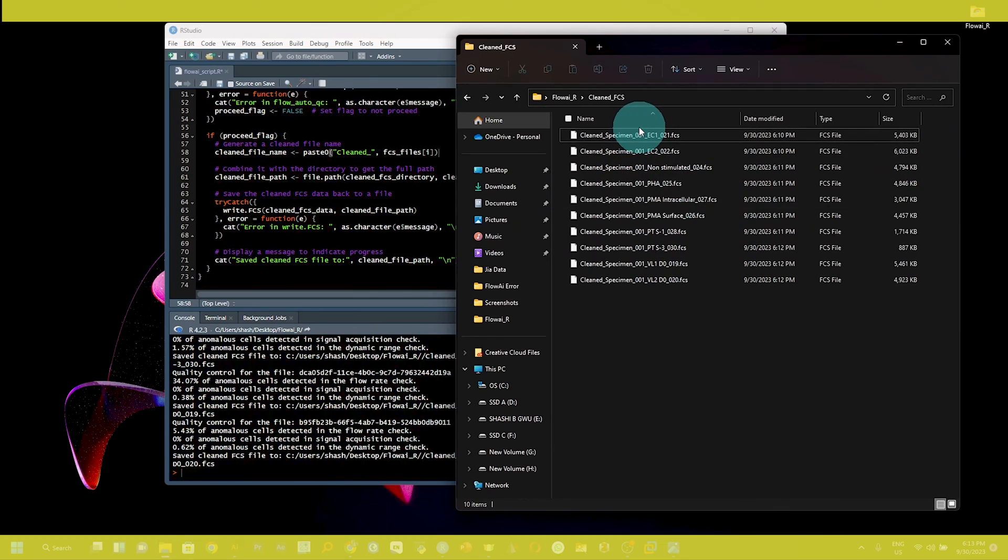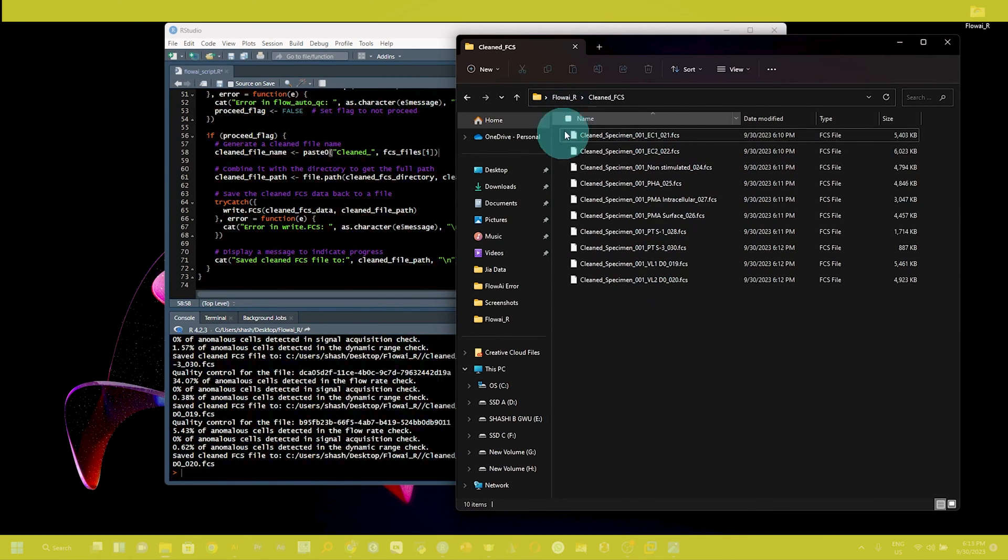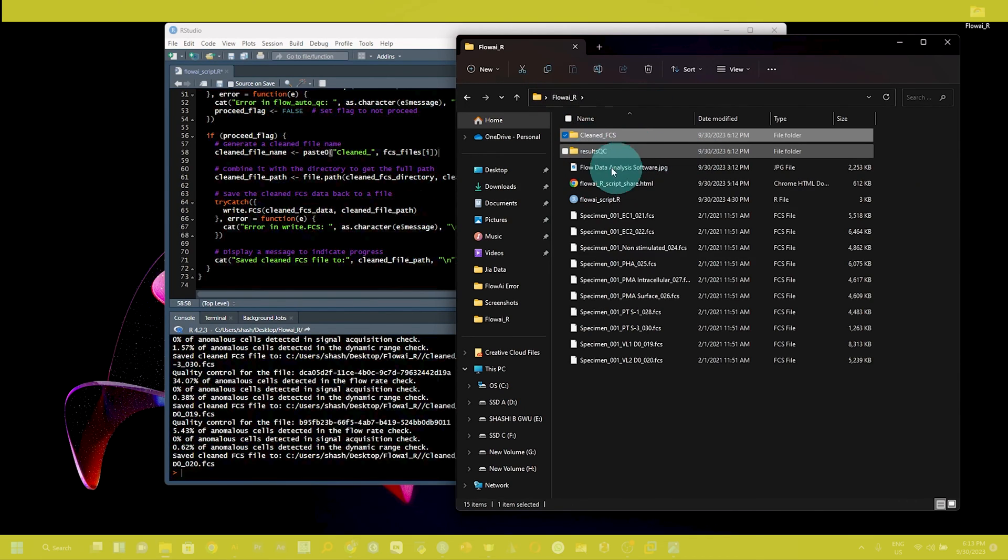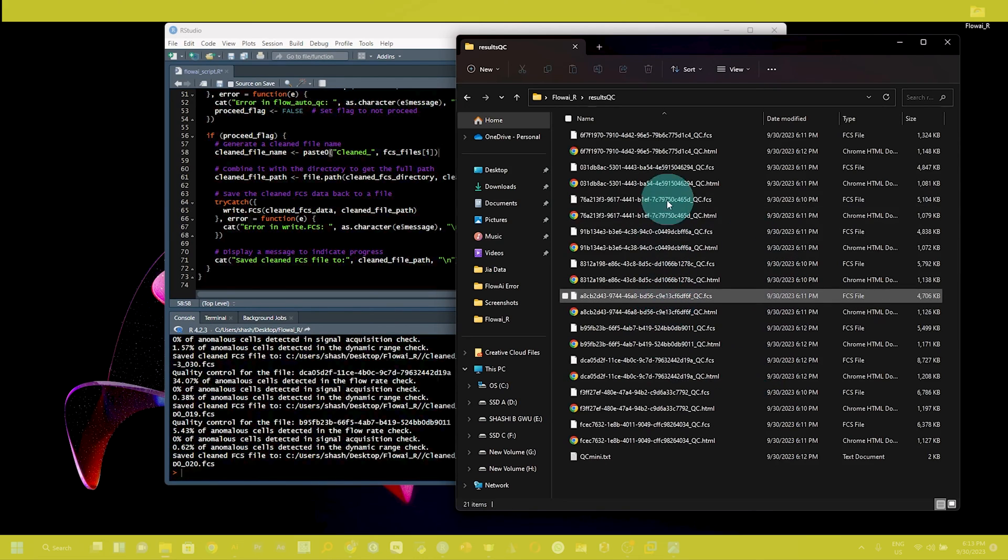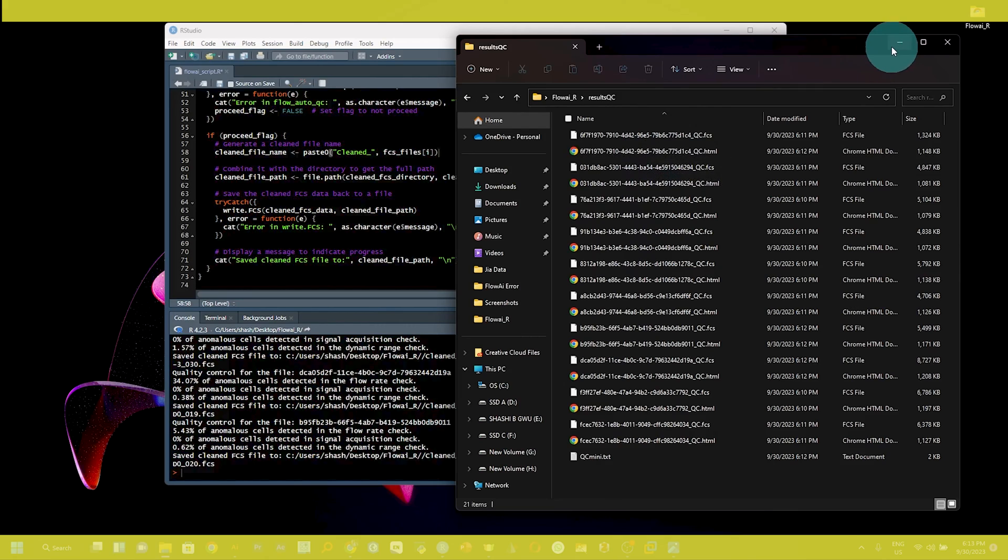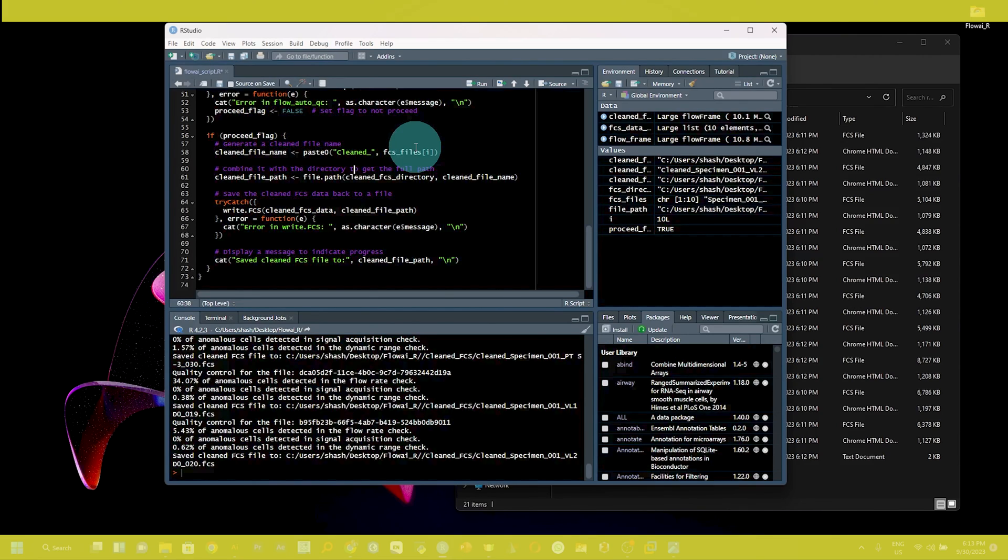We have all fcs files that are cleaned with the R package and the result qc report as well. This is very important and it is very easy to use. So I hope this may help you in your research. Try this, and if you are getting any problem, just let me know. I will try to help you as much as possible.